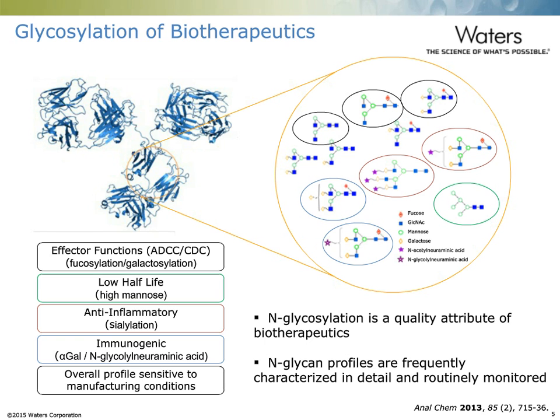Before we get into the nuts and bolts of how this new kit works, what I'd like to do is first touch upon the glycosylation of biotherapeutics and why we care about what's happening with these molecules. Glycosylation of biotherapeutics can affect both the activity of molecules, the half-life of molecules, and as well as cause immunogenic responses in patients. And that's why they're important to monitor.